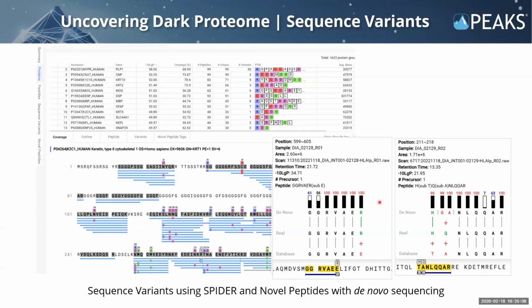So essentially what we'll do is compare the de novo sequence against the database sequence, and we will then try to permutate, and if it matches that MS2 information, we'll be able to construct the real sequence based off both the de novo and the database sequence.